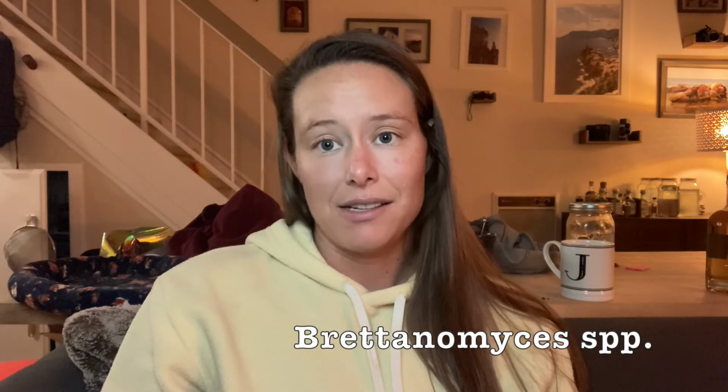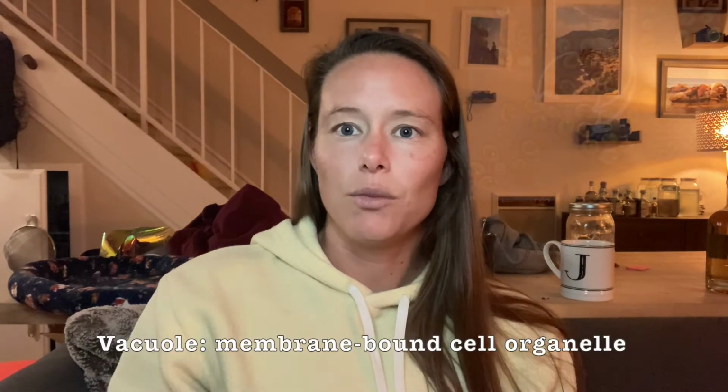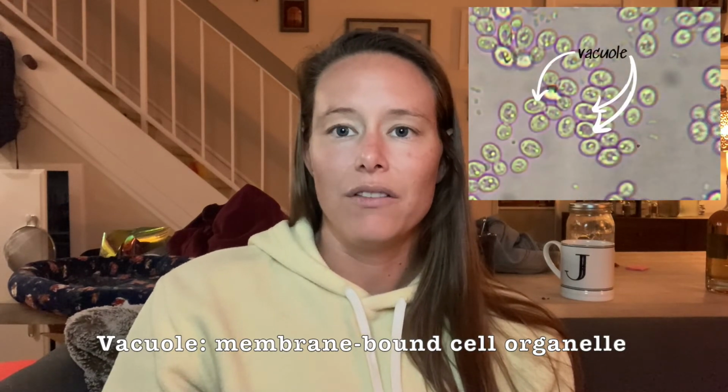These yeasts could also be species of Brettanomyces. So Brett has varied morphology. It can have this circular ovoid morphology, or it could also have apiculate and elongated morphology or cell shape. I did have a little bit of growth on the top of these strawberries, so a little bit of a pellicle layer, and Brett produces a pellicle layer. But also, if you look closely, you can see inside the vacuoles what looks like empty space in the middle of these yeast cells. You can see these dancing bodies.